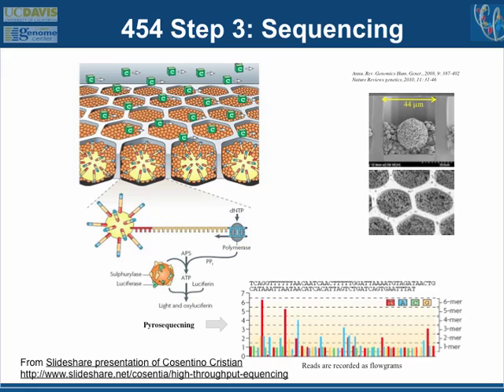And you get a pattern. One of the biggest challenges with pyrosequencing is that if you have a run of, say, 3 A's that are going to be put in your DNA sequence, the DNA polymerase will just put in A's. You just feed it the chemicals. It doesn't have a terminator. You're just giving it enough A's to feed into the reaction, and if there's a run of A's, it will put them all in.